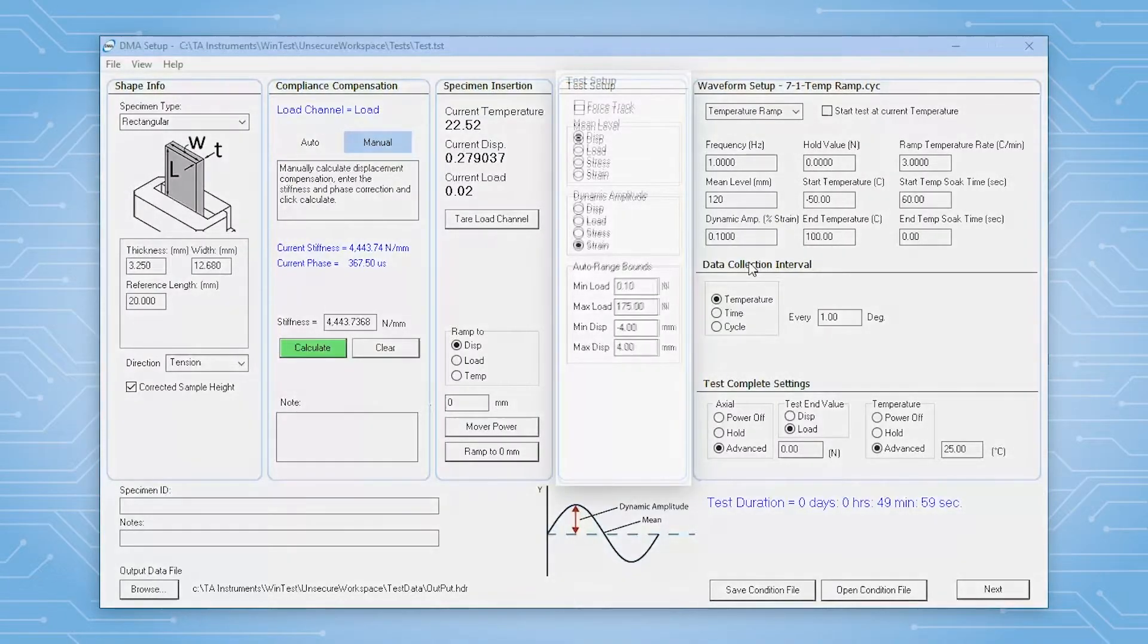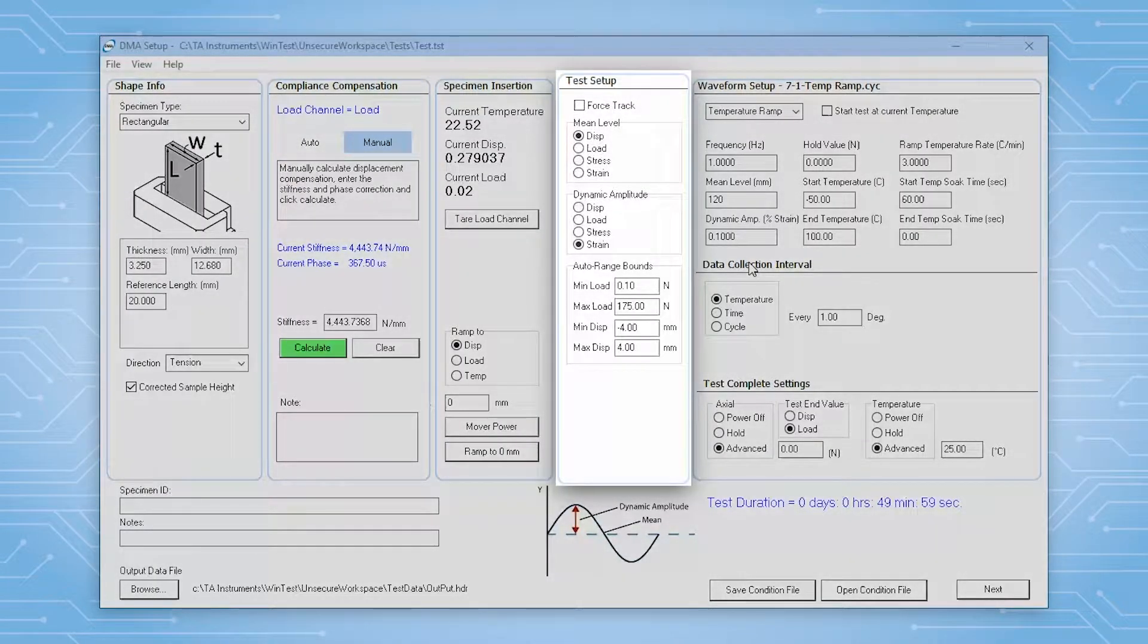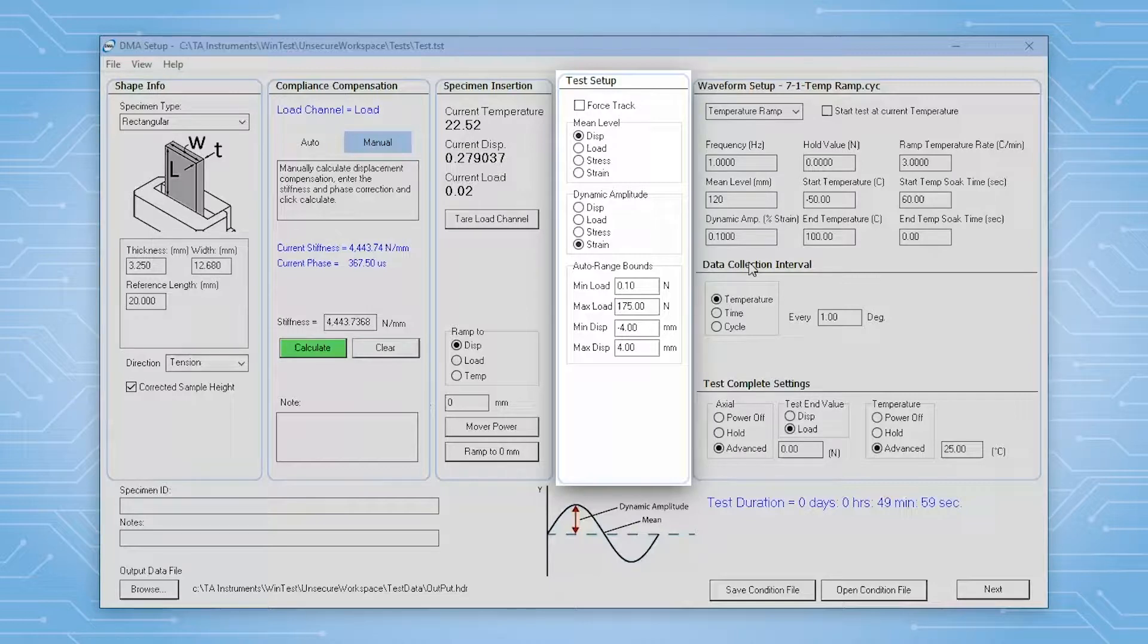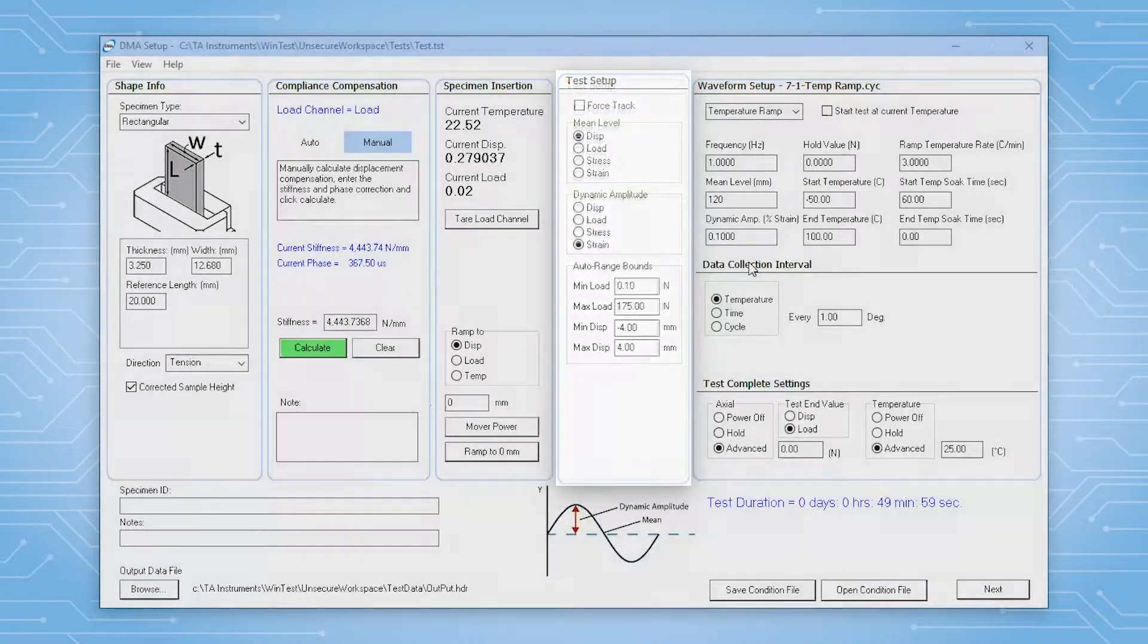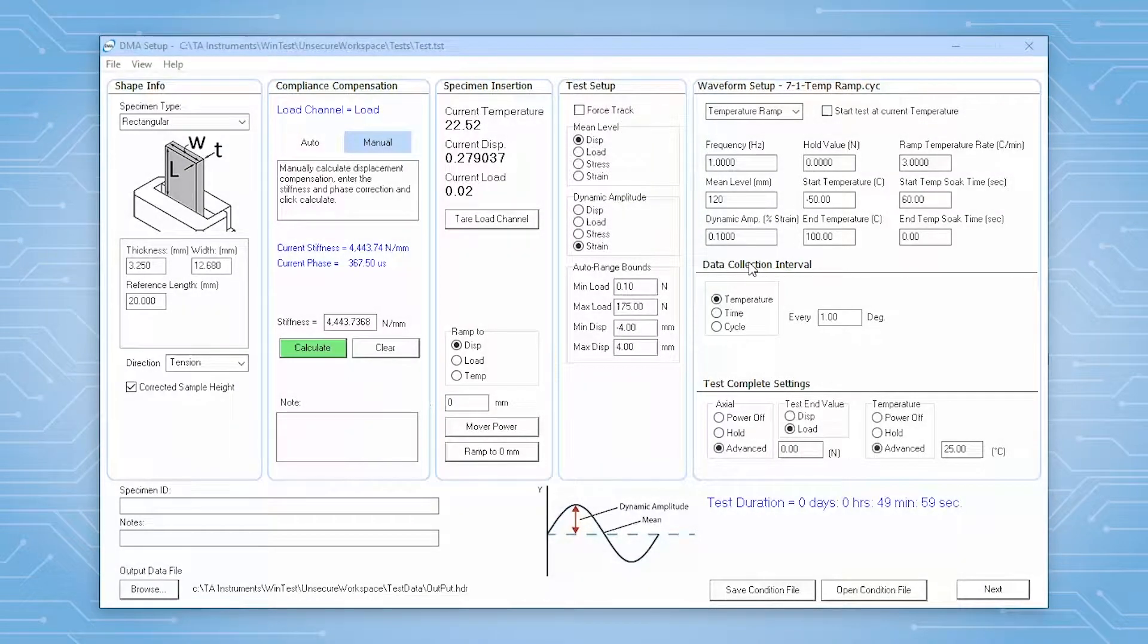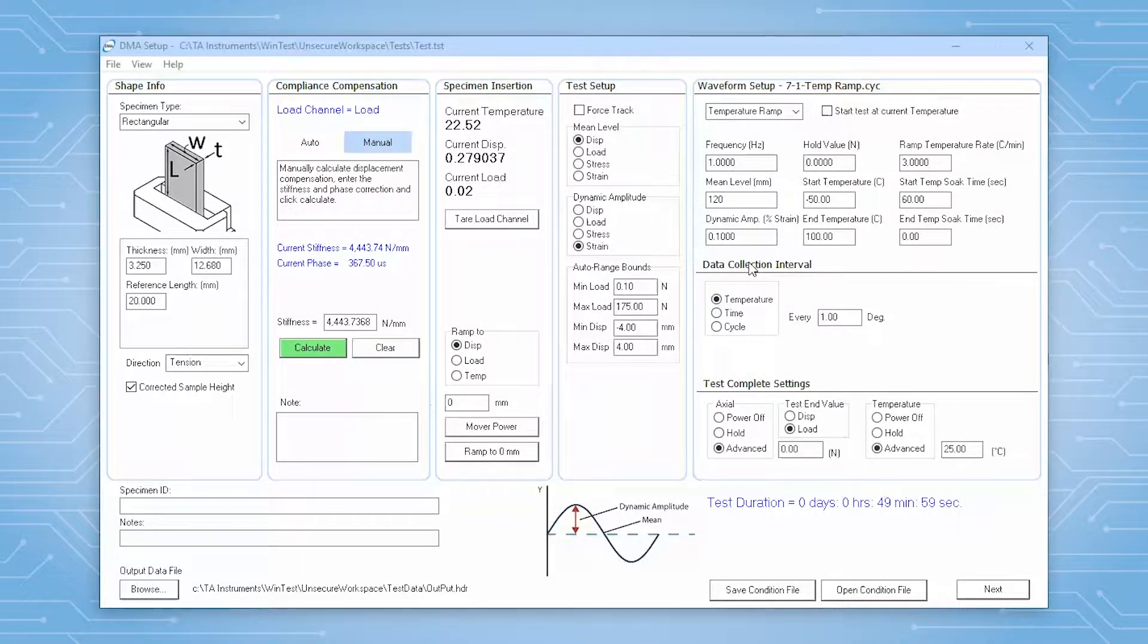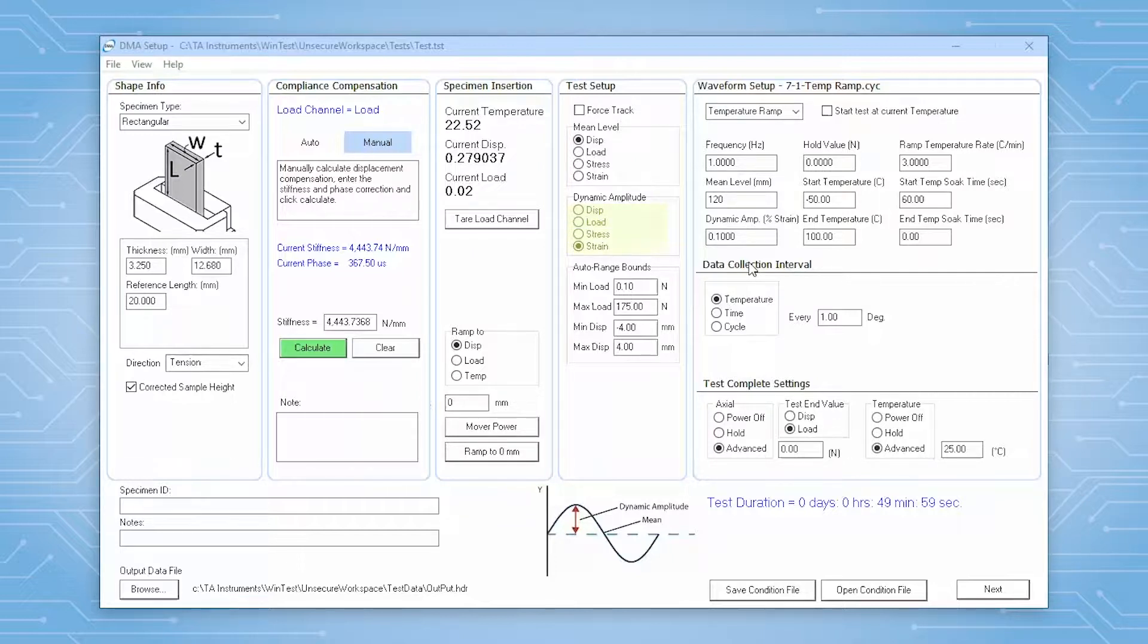In this panel, you can select which control modes are used for both the mean level and the dynamic amplitude. You can choose which of these four channels is your oscillating variable: displacement, load, stress, or strain.